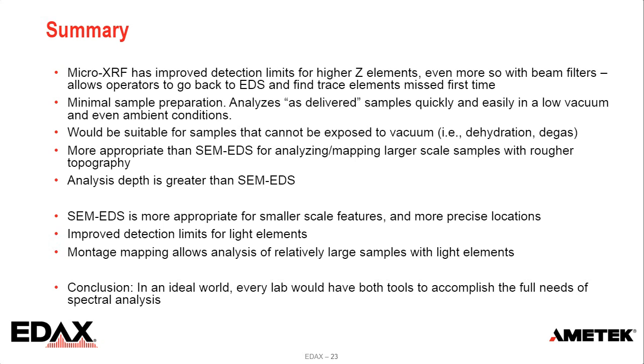On the micro-XRF side, the excitation of lower energies is not as efficient because there is very little X-ray emitted at low energies. The excitation X-ray tube generally has a heavy beryllium window to maintain vacuum in the X-ray tube. The detector for micro-XRF generally has a beryllium window as well to block the light in the sample chamber.